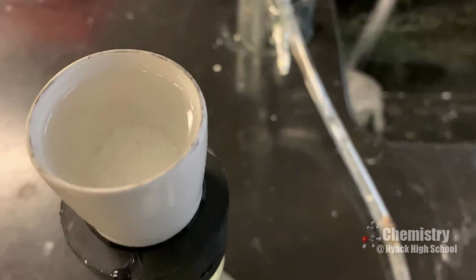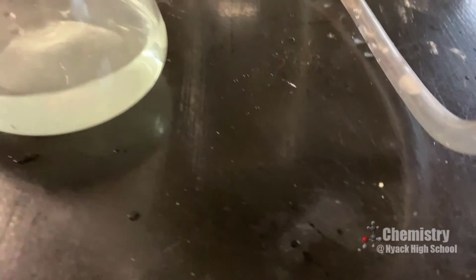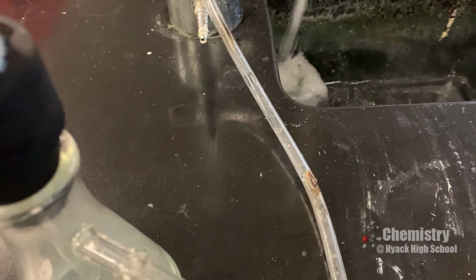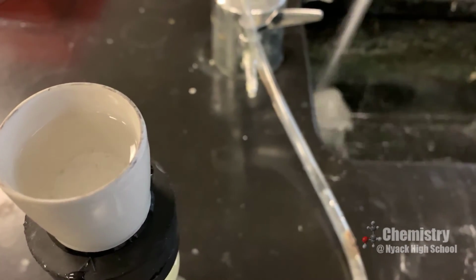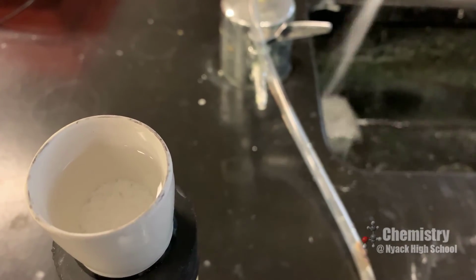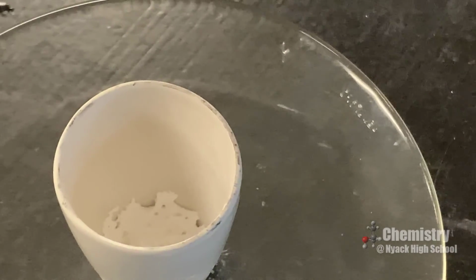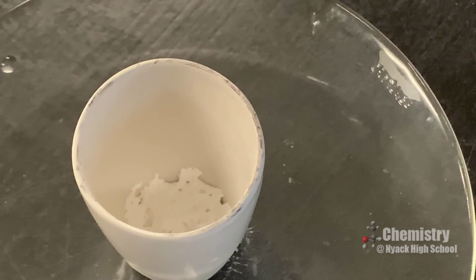I've quantitatively transferred the silver chloride to the Gooch crucible. The liquid in my filter flask looks relatively clear. That means I didn't lose much, if any, silver chloride. So I'm going to wait for the rest of this to filter through, and then I'm going to take it off of the adapter, and we're going to pop it in the oven to dry overnight. Okay, so the silver chloride crystals have been washed thoroughly, and they are ready to go in the drying oven to be dried overnight, and we will mass it the next day.